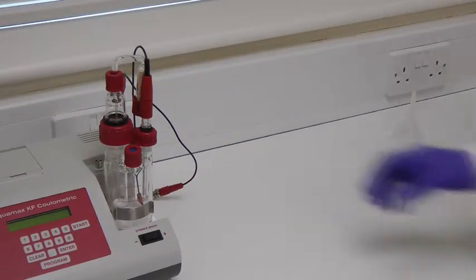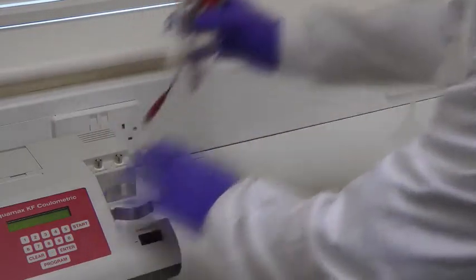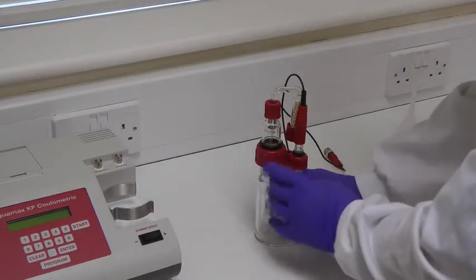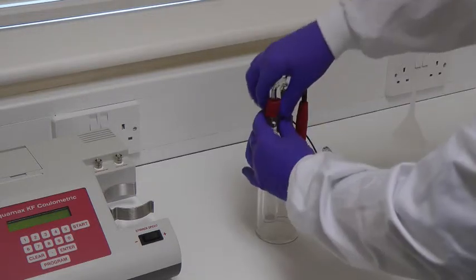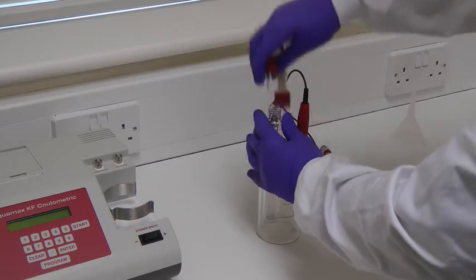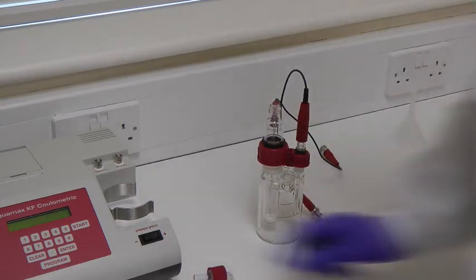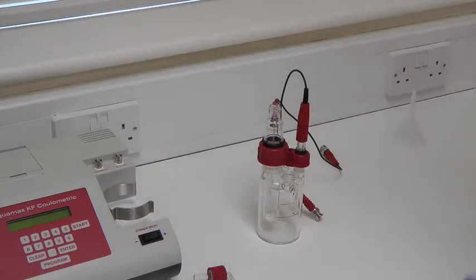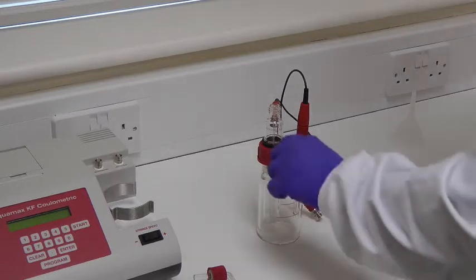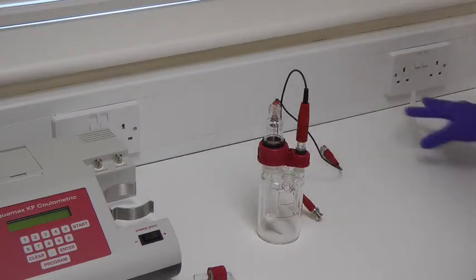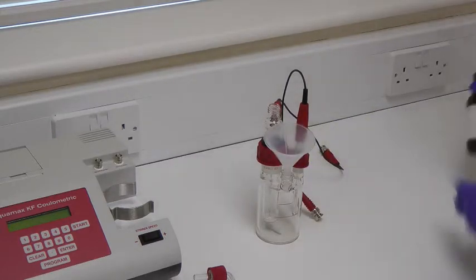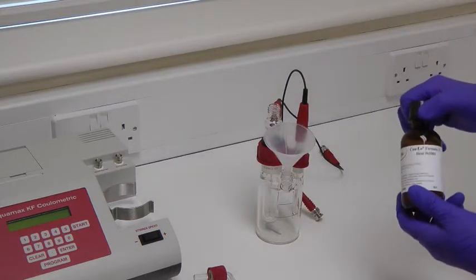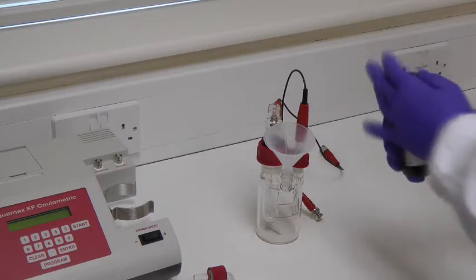Before adding the chemicals, remove the assembled glassware to avoid spillage on the instrument. Remove the injection port and the drying tube and insert the stirrer bar. Add the full 100ml bottle of reagent using the supplied funnel and reconnect the injection sceptre.